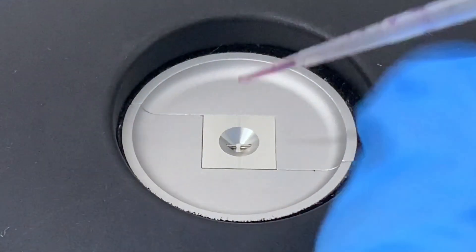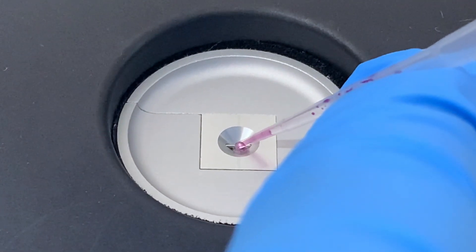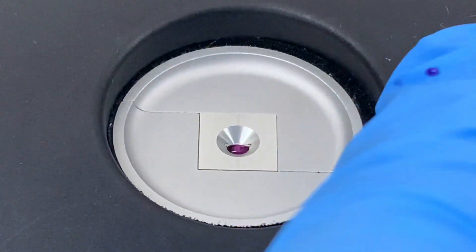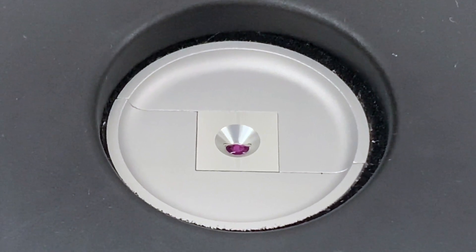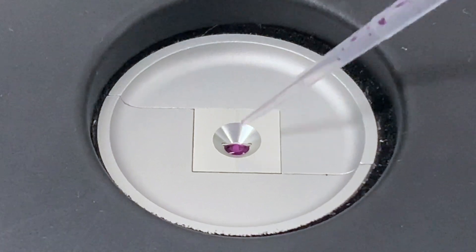Fiber-optic pins on the microvolume sample port are fixed in place, which means there is no chance for them to move or shift over time, affecting your sample results. It's easy to both pipette onto the instrument and also if required to recover the sample by re-pipetting off.